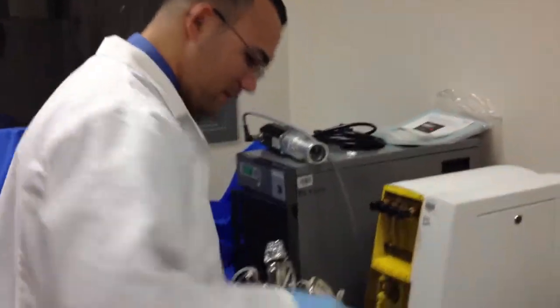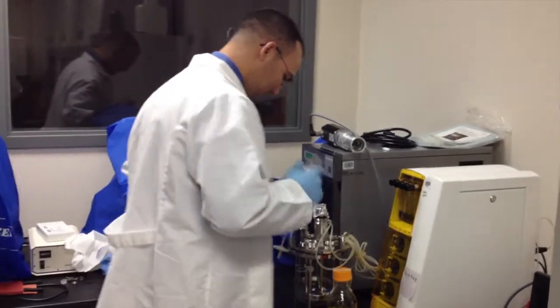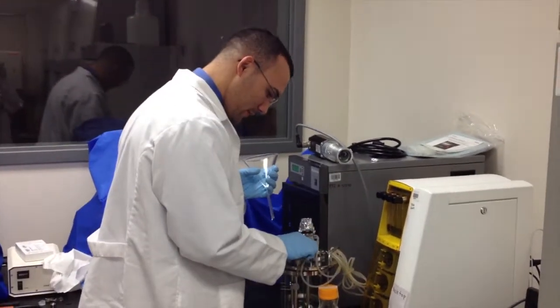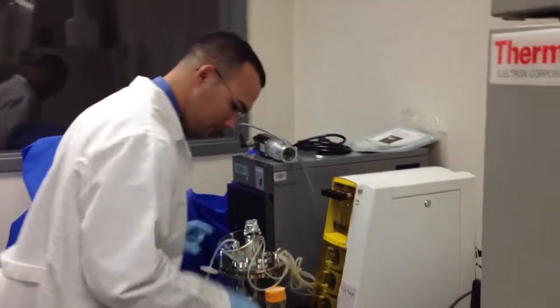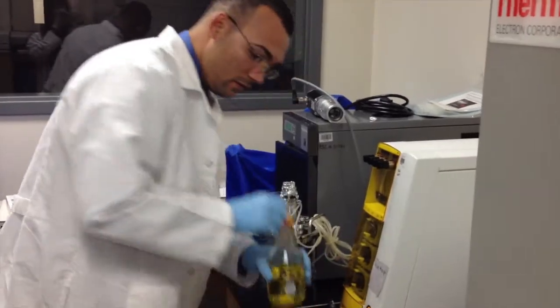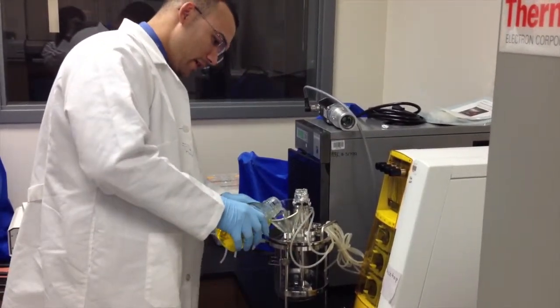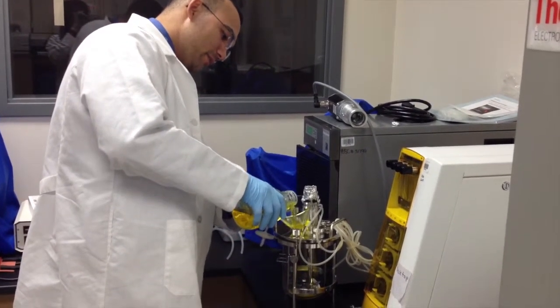Alright, we're going to get our trusty funnel here that's been autoclaved. We're going to open one of the ports, put in the funnel here, open up our LB broth, and slowly put in our LB broth. Making sure we don't put too much at one time.